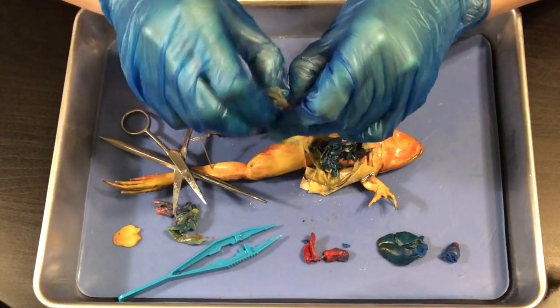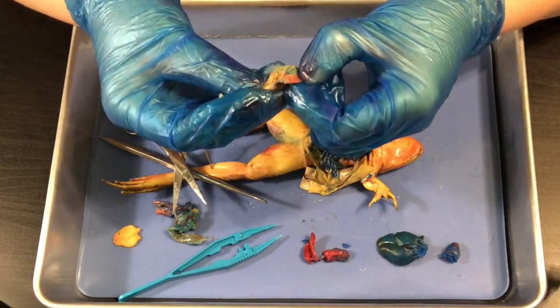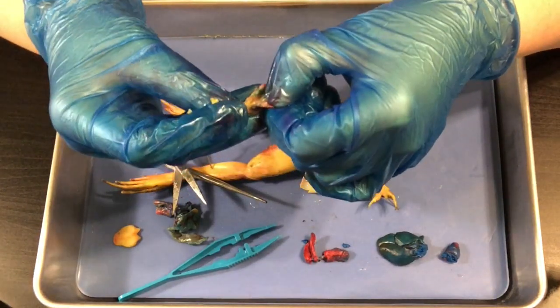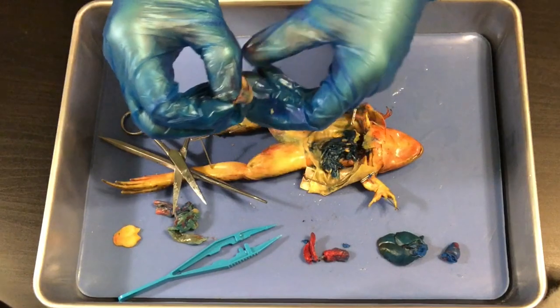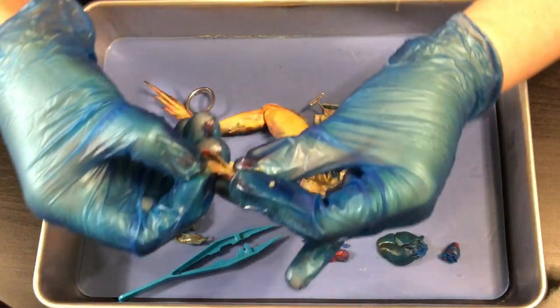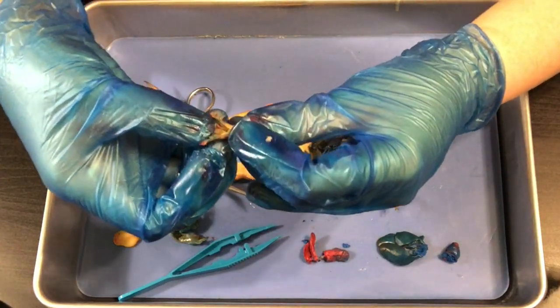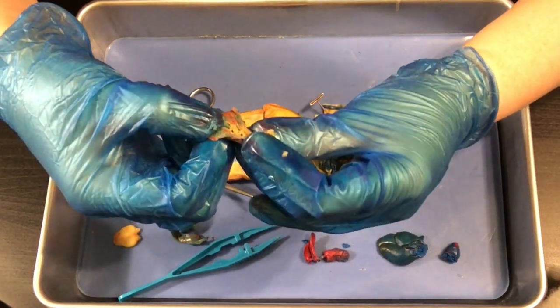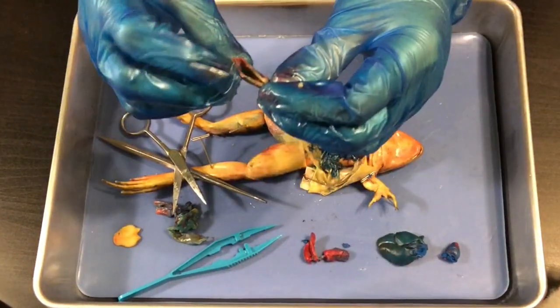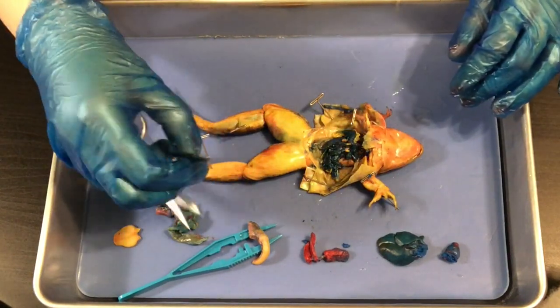If we open up the stomach and stretch it out a little bit, you'll see wrinkles on the inside. It looks like there's nothing in our stomach today, but you might hopefully find something in yours. What I want you to notice is those wrinkles on the inside — they're called rugae. We talked about this when we did the digestive system: you eat your huge Thanksgiving dinner and then somebody says there's dessert. This is how your stomach makes room for it — those wrinkles help it stretch out.